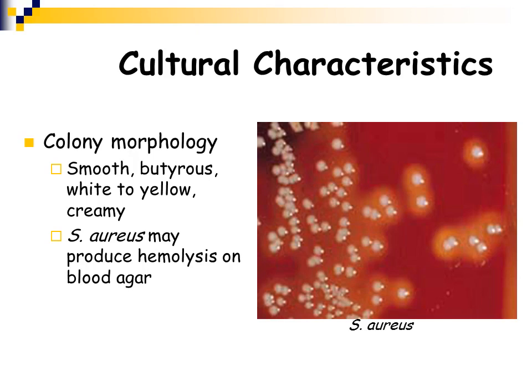On blood agar plates, the organism is smooth, a whitish to yellowish color, and a bit creamy looking. So the coagulase negative staph tend to be more of a whitish color. Staphylococcus aureus tends to get a golden or yellowish hue to it. Also, your Staphylococcus aureus is usually beta hemolytic, so you're going to see a little clearing around the colony on a blood agar plate.